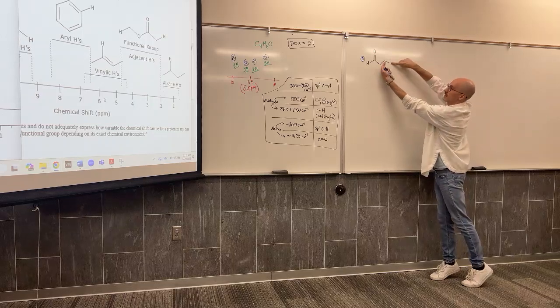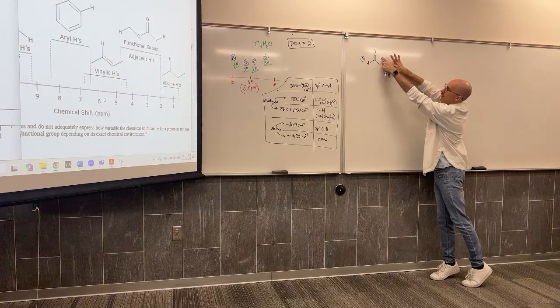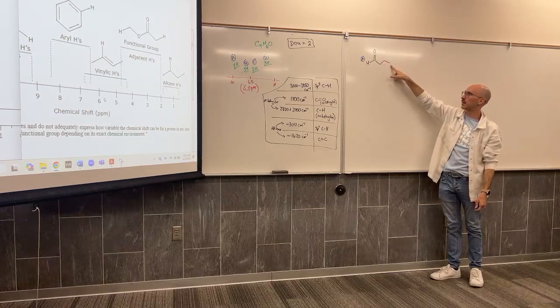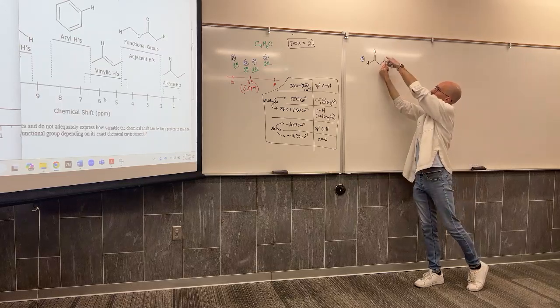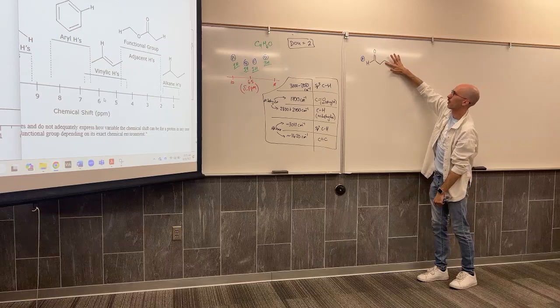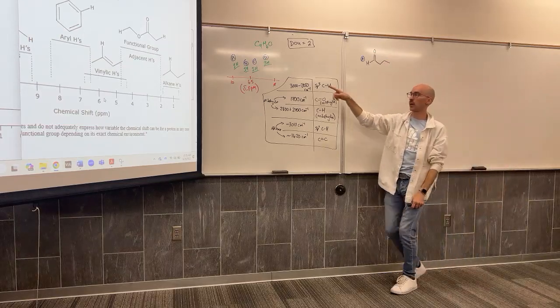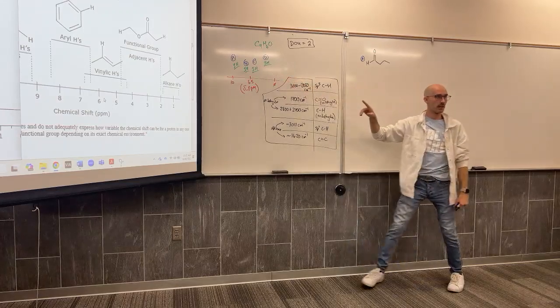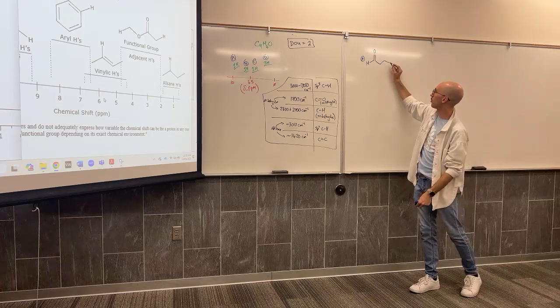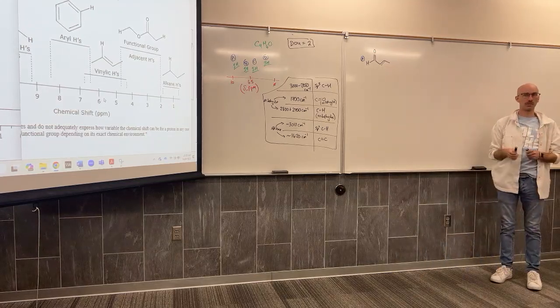If the double bond is here, I still have an sp3 CH. If the double bond is here, I get 1, 2, 3 vinylic hydrogens, a CH2 at the end. And if my double bond is here, I only get 1, 2, plus a CH3, or if it's here again, I get a CH2. And my integrations tell me I need to have a CH3. CH3 is only going to show up at the methyl group. So I cannot put a double bond there. I can't get rid of that methyl group. I can only put a double bond there.